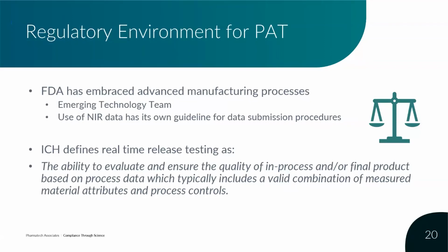And then finally, a product's partial or total release is possible using process analytical technology data. Real-time release testing is not required when you use process analytical technology. So you can have process analytical technology, but not use that data to release.